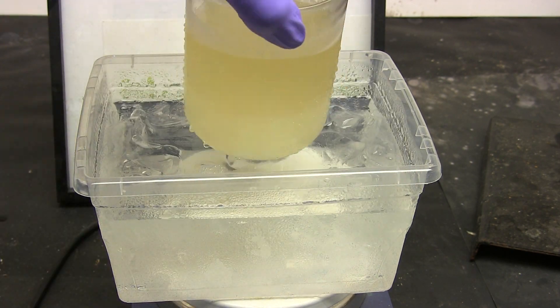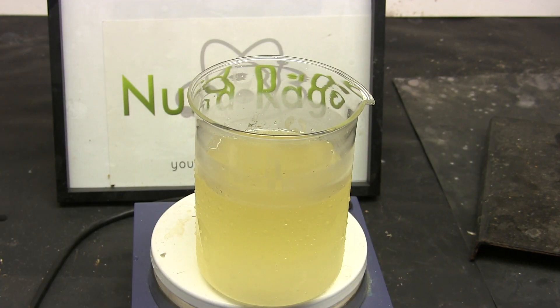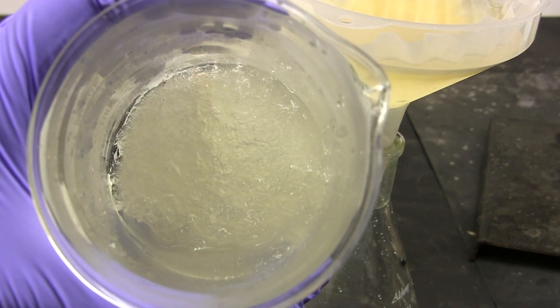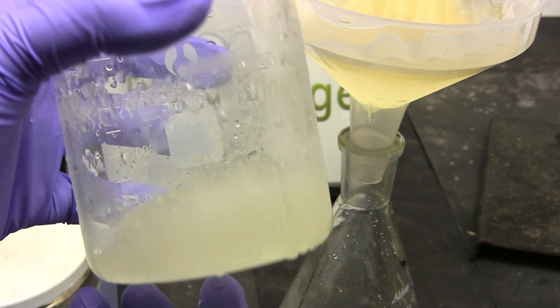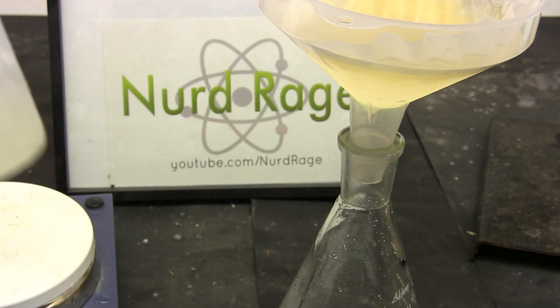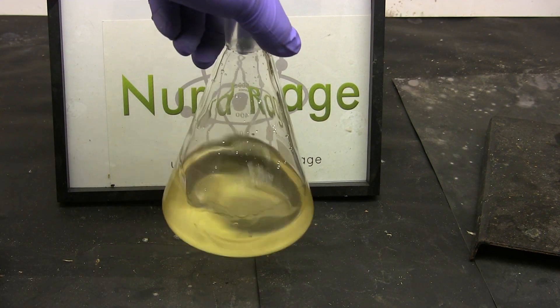After an hour or so, remove the beaker and filter off the sodium sulfate crystals. You can see here the massive amount of sodium sulfate still in the beaker. Let me skip ahead to when the filtration is finished. Here is our solution of hydrobromic acid.